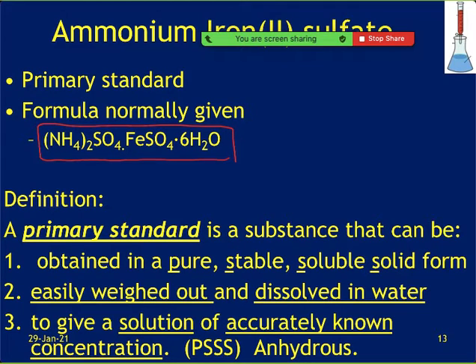So the other primary standard that you've worked with is anhydrous sodium carbonate.